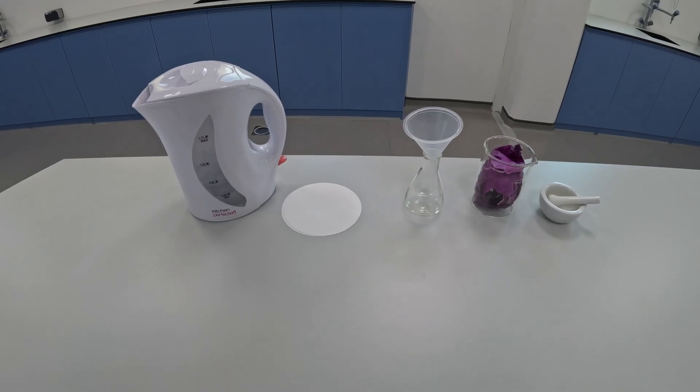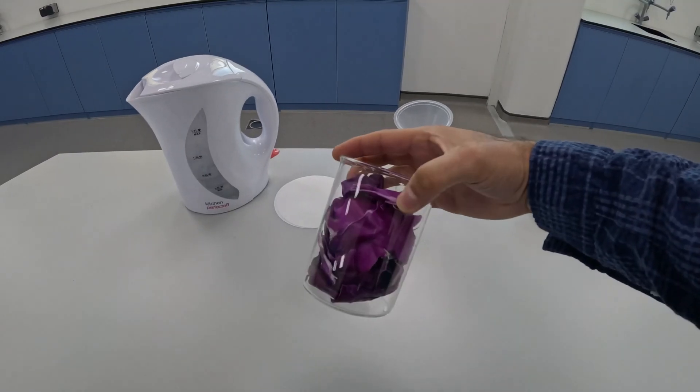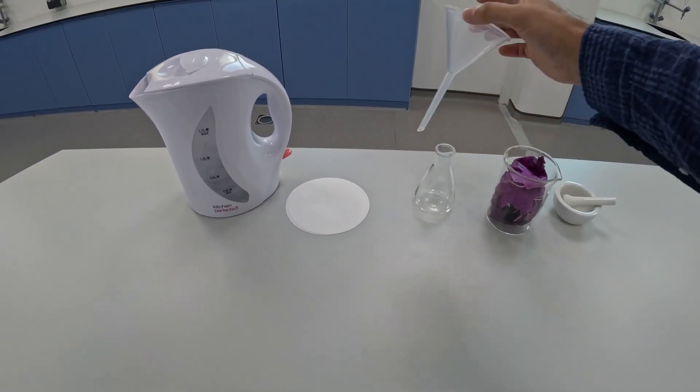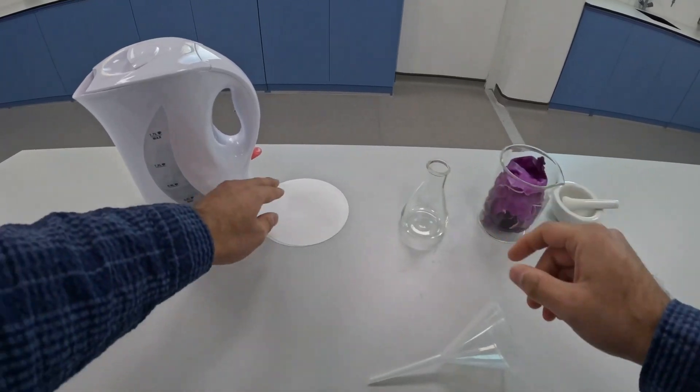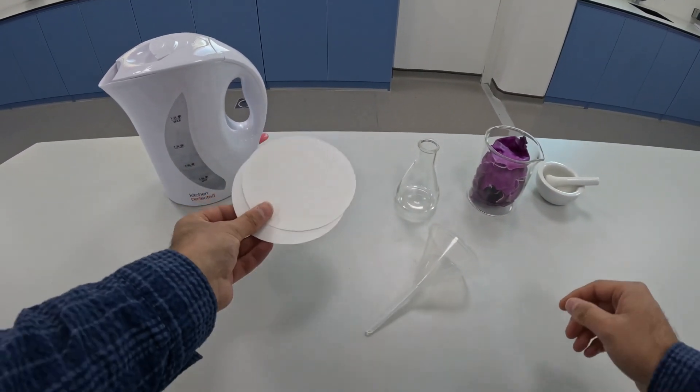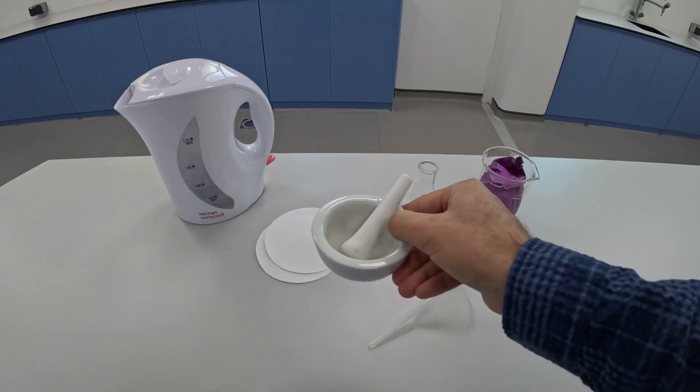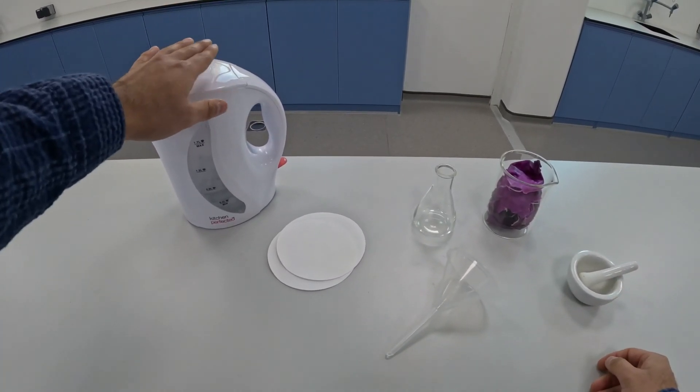To make red cabbage indicator you're going to need some red cabbage, a filter funnel, a conical flask, some filter paper, a pestle and mortar, and some hot water.